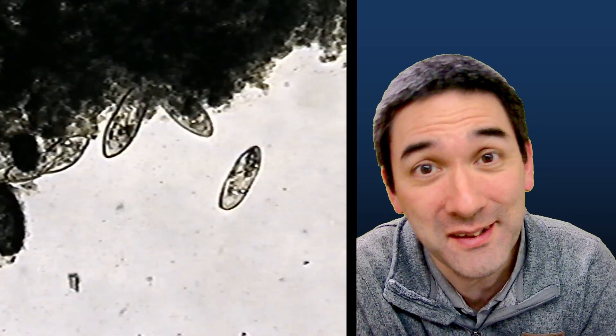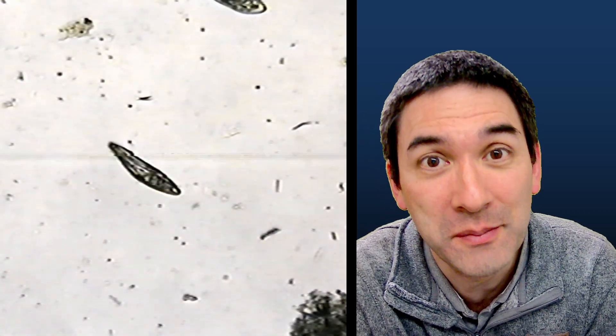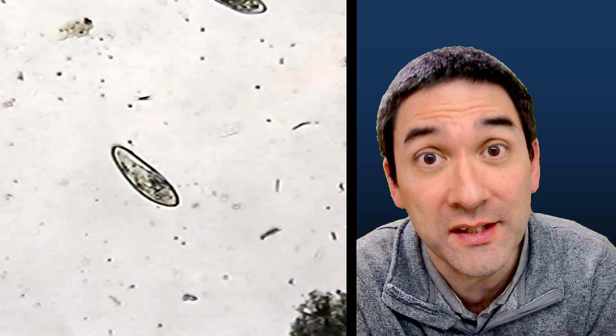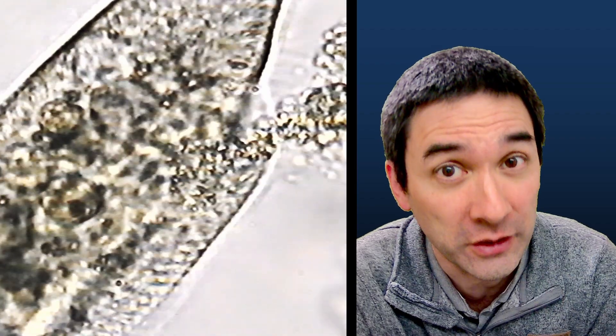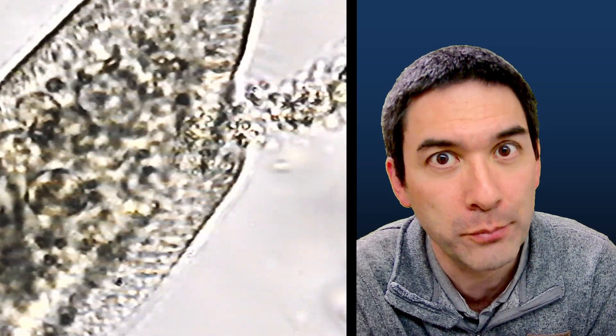Well, these here are paramecia, single-celled microorganisms having a real stress. As a matter of fact, they have lost so much water because of salt that I added, and this one over here is pooping right now.